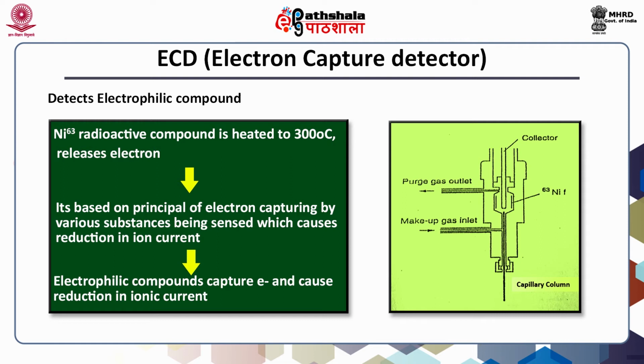Chemicals containing an electron-active element, for example chloropesticides, or group have a strong affinity for electrons. In the gaseous state, they tend to capture electrons to form negative ions, and exposing these compounds to a source of low energy electrons forms the basis of an extremely sensitive selective detector for such compounds.